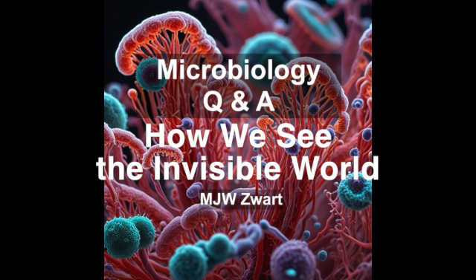Well, for example, if you're trying to observe a specimen that doesn't absorb much light, it can be difficult to see against a bright background. So how do you see something that's almost transparent? That's where dark field microscopy comes in. It uses a special condenser which focuses light onto the sample from the sides. So only the light that's scattered by the sample reaches the objective lens, making the specimen appear brightly lit against a dark background. Oh, that's clever. It's like using a spotlight to highlight something in the dark.